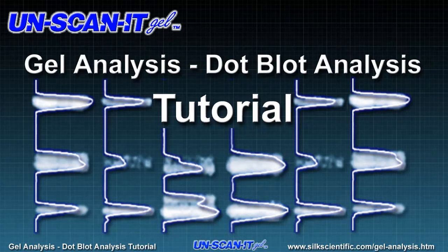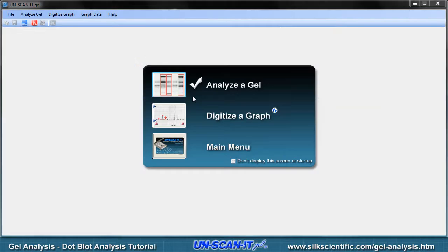Welcome to the gel analysis dot blot analysis tutorial for the Unscannit Gel software. This tutorial will show you how to use the dot blot analysis mode of the Unscannit Gel software to quantify dot blot images. When the software is opened, a start-up screen will appear and a pop-up menu will allow you to analyze a gel. This option can also be selected from the main Analyze Gel menu or the Analyze Toolbar.